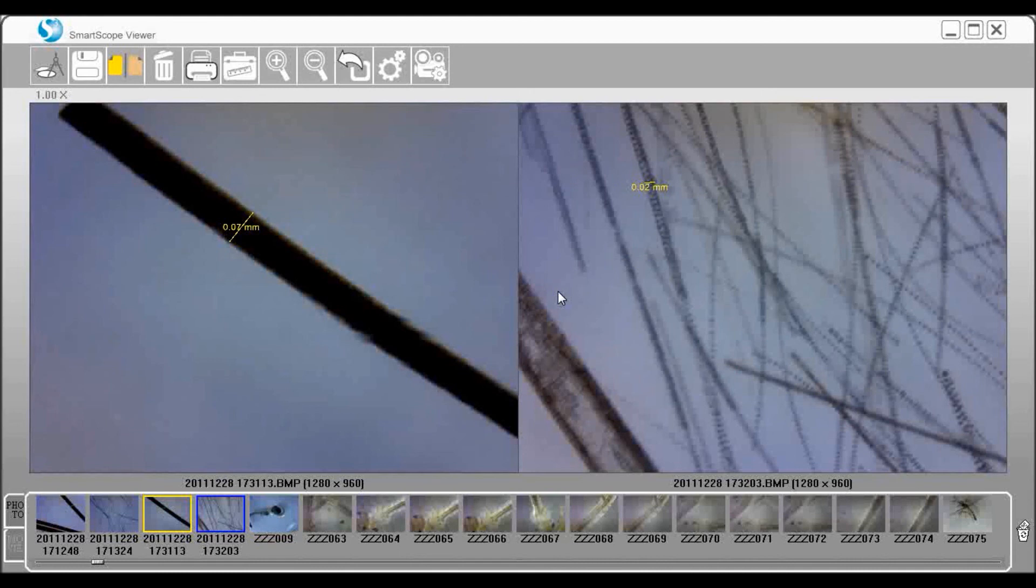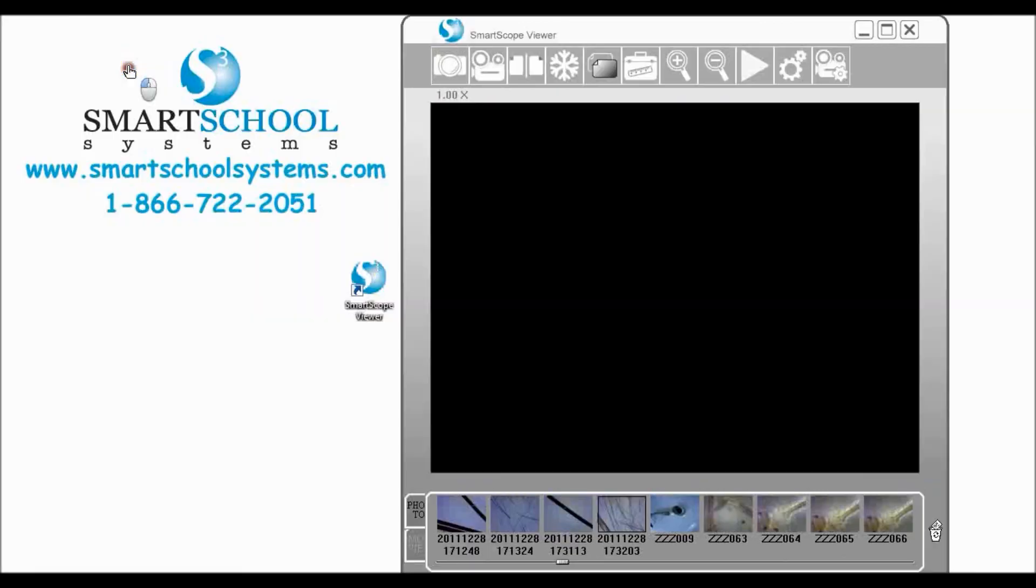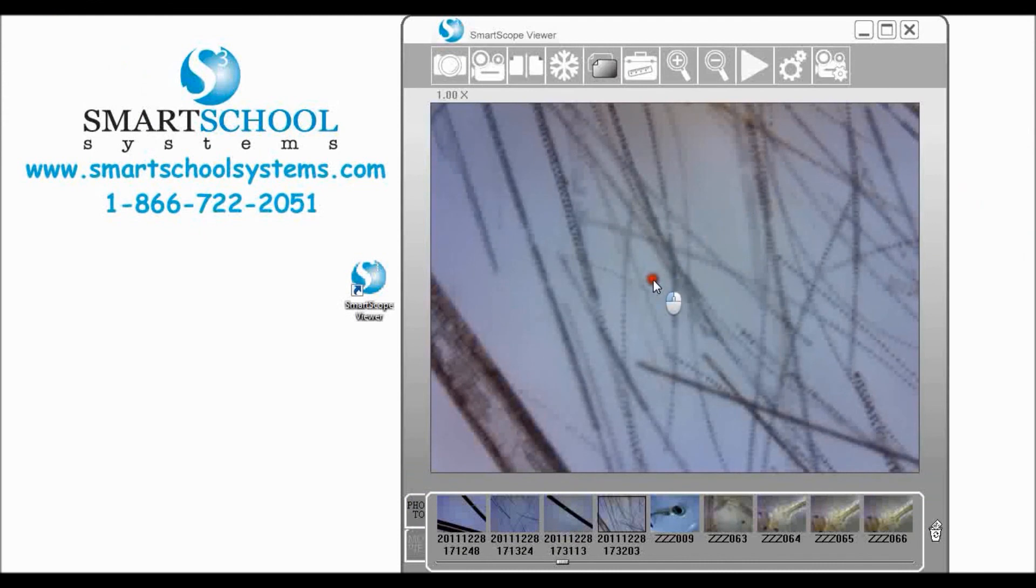So you can see that this is to measure within the SmartScope is very functional. It's pretty easy to do.